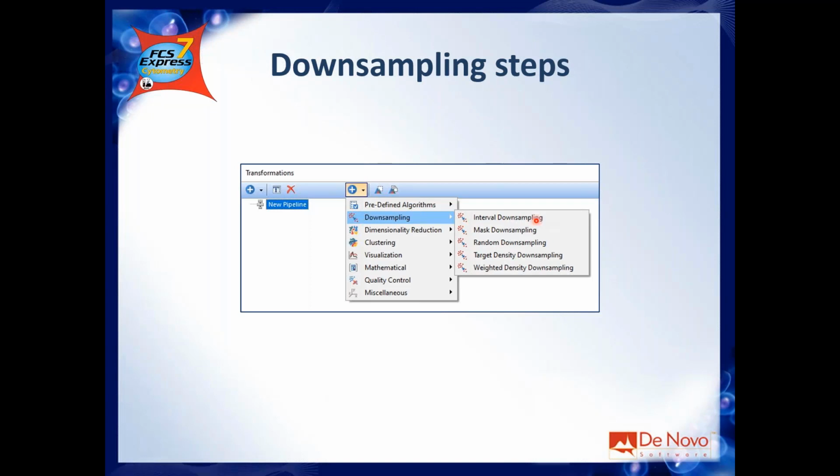With a mask downsampling, you can add a max downsampling downstream and say, I want to remove all the events that have all 0 from the 3 previous steps. It means all the events that have been flagged as a bad guy by all the previous steps. Or you can say, I want to remove only the events that have been flagged at least once as a bad guy. So it's really cool stuff.